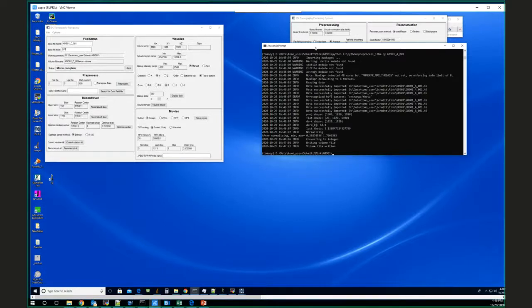There's a commercial package, actually it's free to academics now, called Dragonfly, and it's beginning to incorporate machine learning, because this is a perfect place to use machine learning. You as the trained operator can go in for a few slices and do it manually. You say, this is phase A, this is phase B, this is phase C. And once you train the machine learning, it can use what you did on a few training slices to do the rest of the slices. At least that's the idea. And I think it can be fairly successful, again, depending on the complexity of the data.